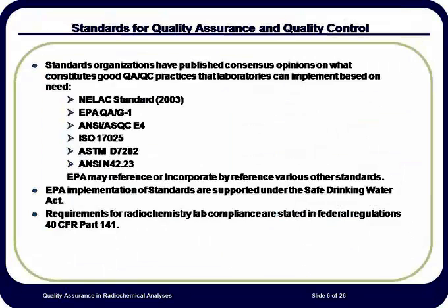Listed on this slide are several documents that provide guidance on how to establish a quality assurance program. The analytical requirements for the radiochemistry laboratory and analysis of samples for drinking water are cited in 40 CFR 141. Keep in mind that when regulations change, they will be published in the Federal Register, and 40 CFR will be updated in the next annual revision.